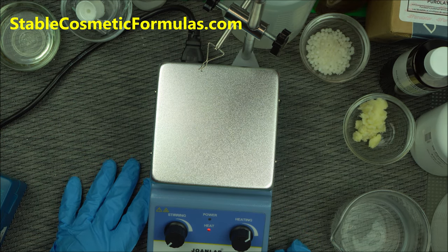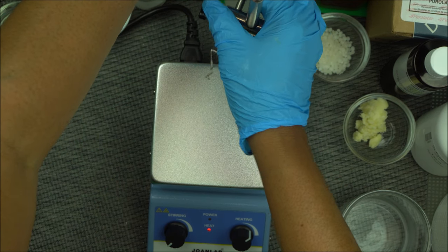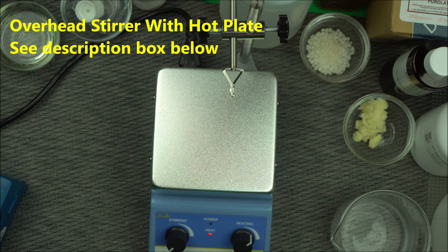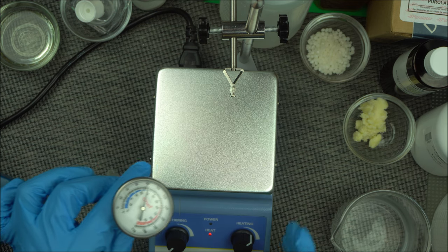Like I said in the recipe, it's going to do you well if you have an overhead stirrer with heater, because we are going to need that. If you have a lab water bath, you can also use that, but I prefer to use the overhead stirrer in case you want to check the temperature of your water.